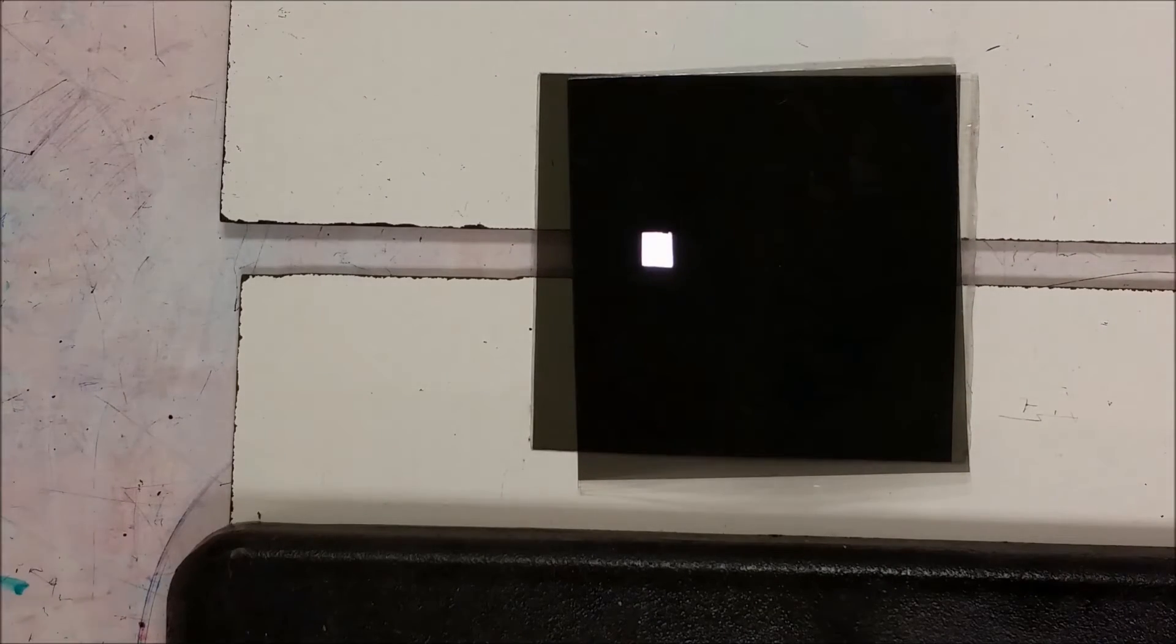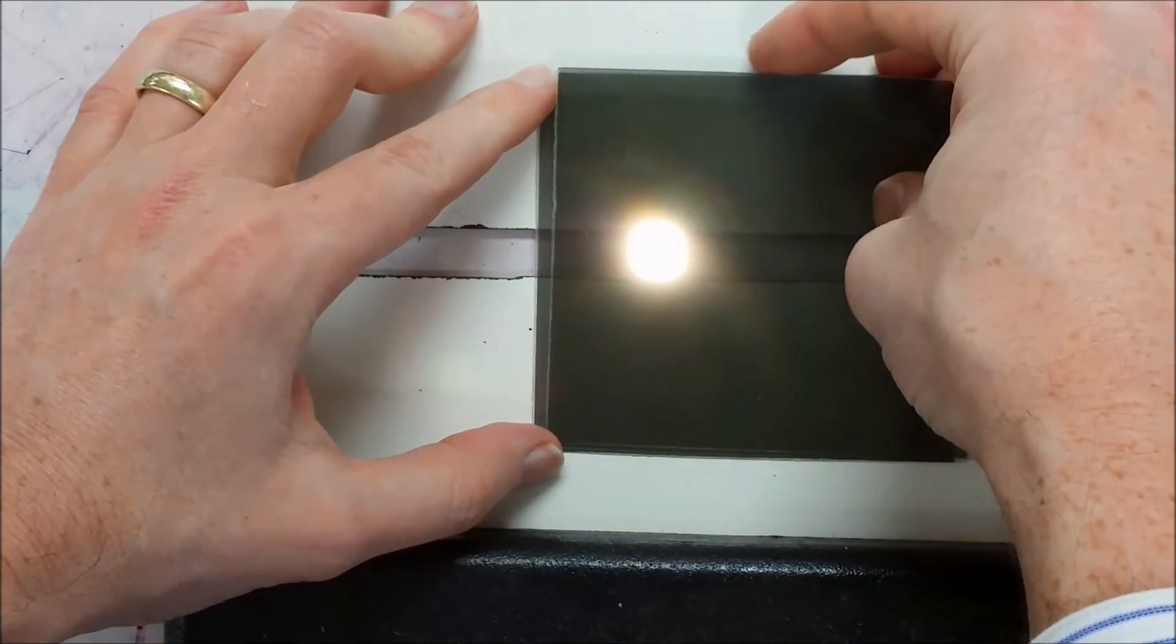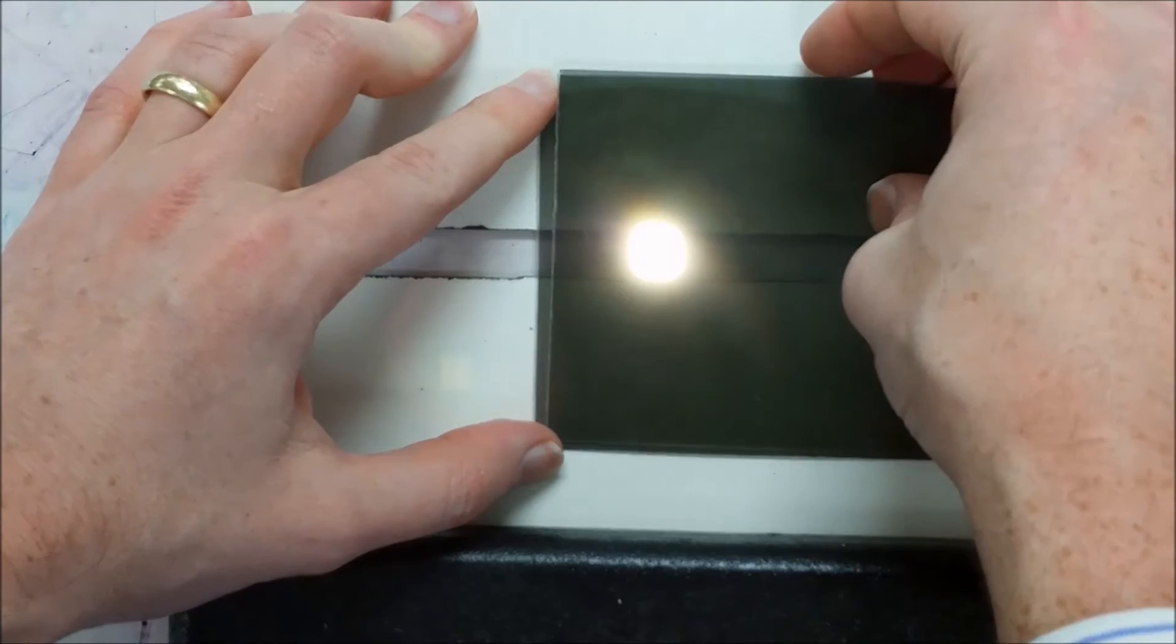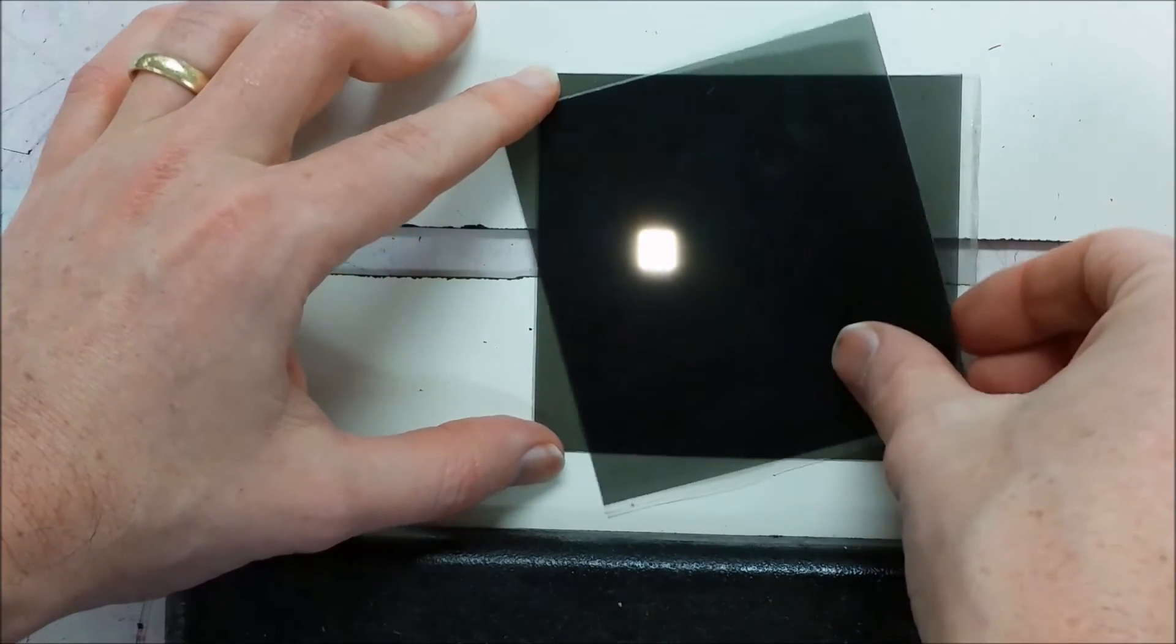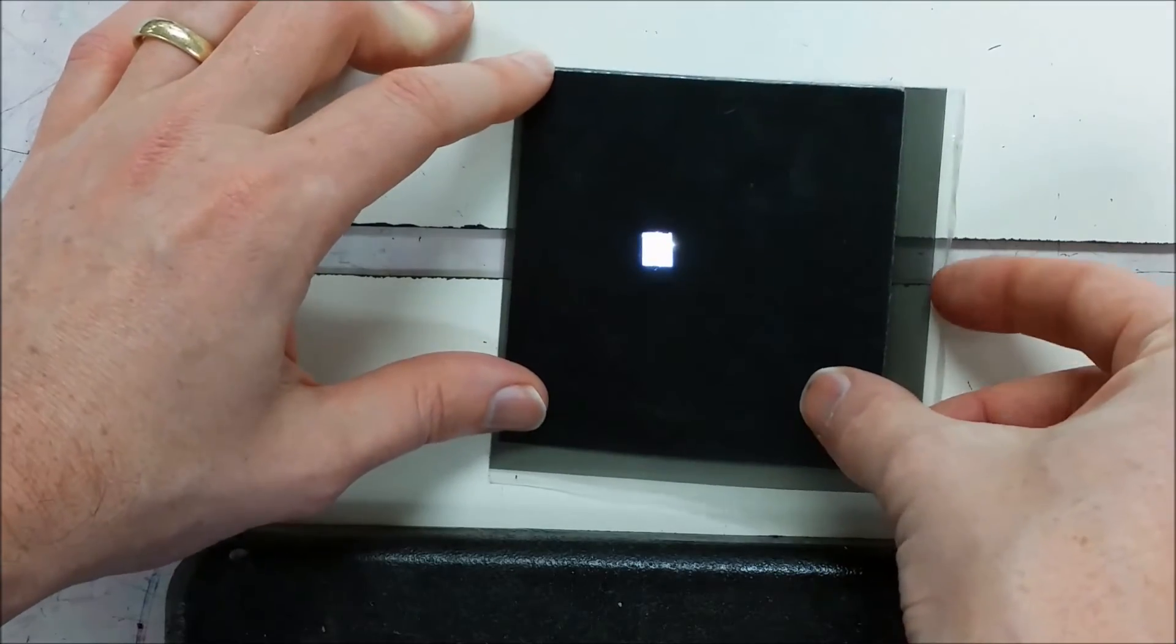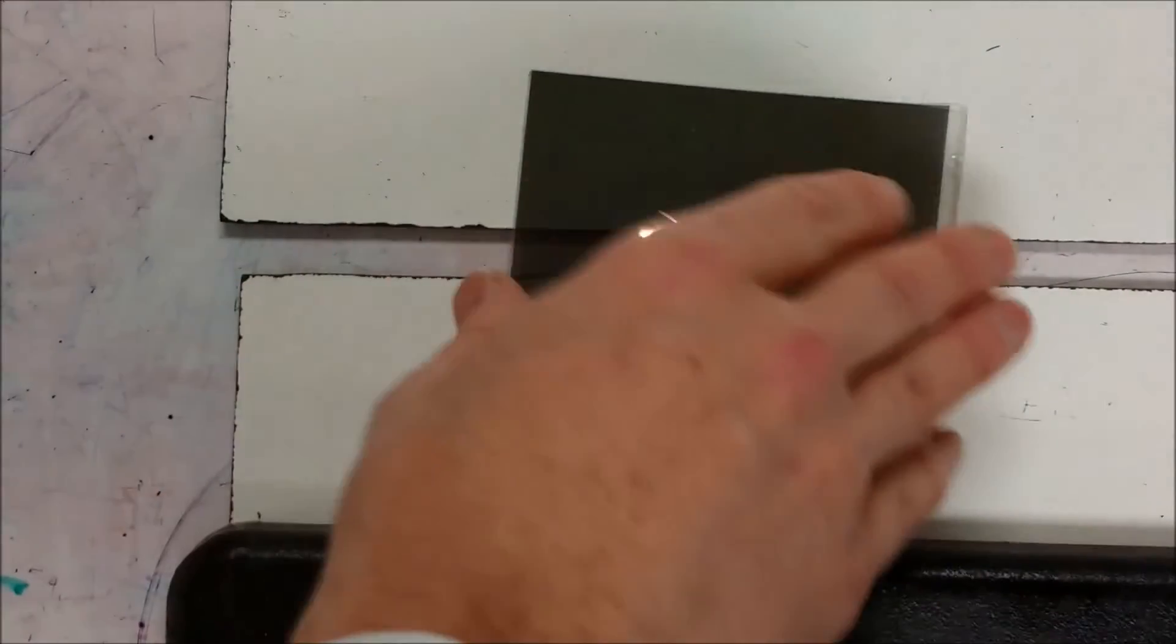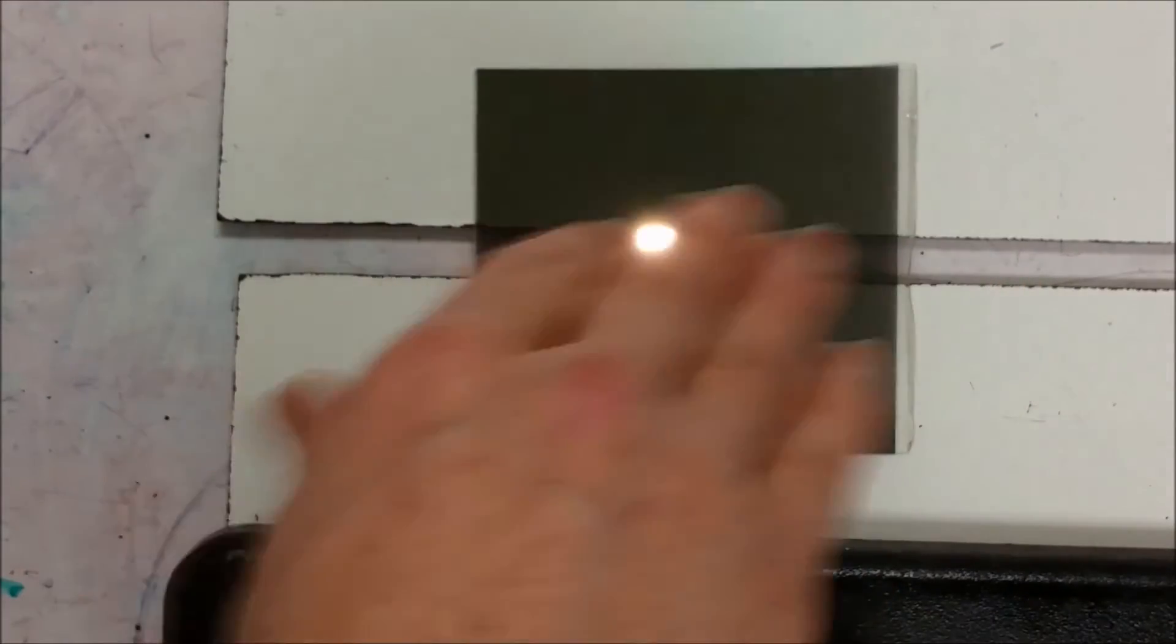So here we have two polarizing filters, and these are currently perpendicular to one another. So if I move them like this, you can see there's a very intense light coming through, that as I rotate them, that light gets blocked out by the second filter. So what's happening here is these are now perpendicular. So the first filter is letting through a plane polarized light that's polarized in one direction.